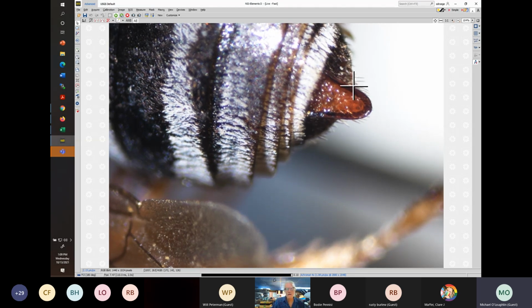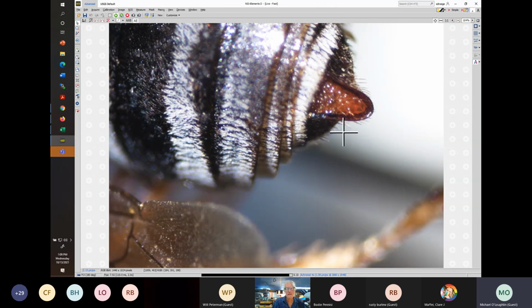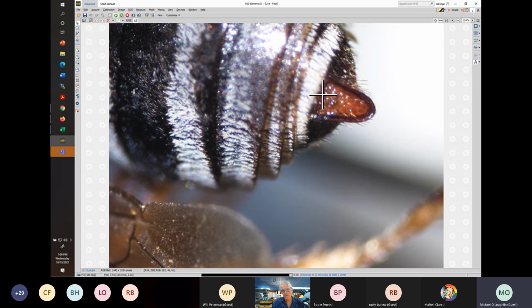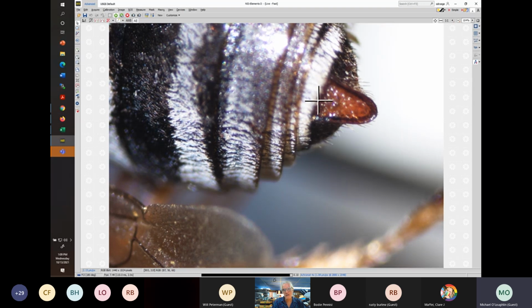Okay, so here it's relatively narrow and long. Again, this is one of these things that's very difficult to be absolute about. In this specimen, if we have time later, I'll try and pull some more. The line that we've been talking about that divides it is right there. It's barely visible because the rim of what should be T6 is partially hiding it. And this separates the plane further down from the plane further back.